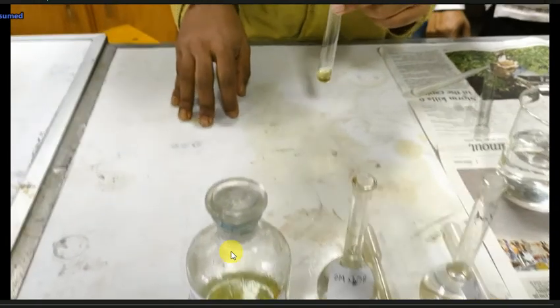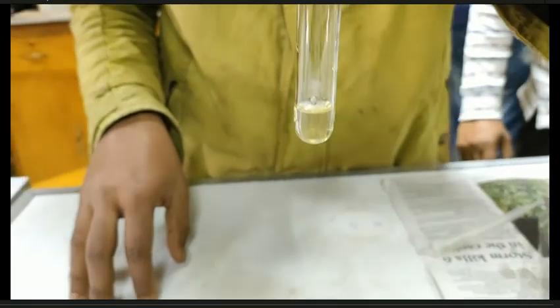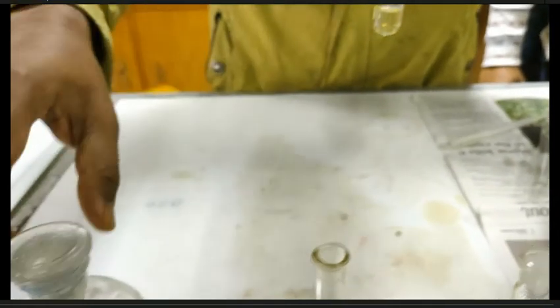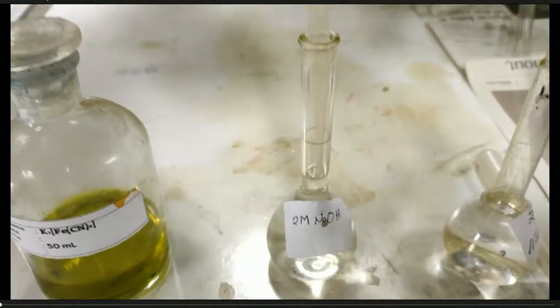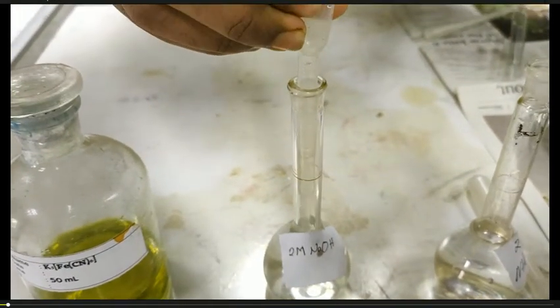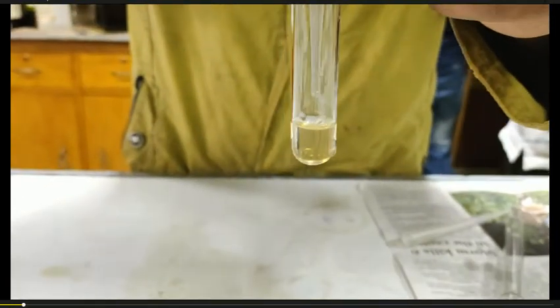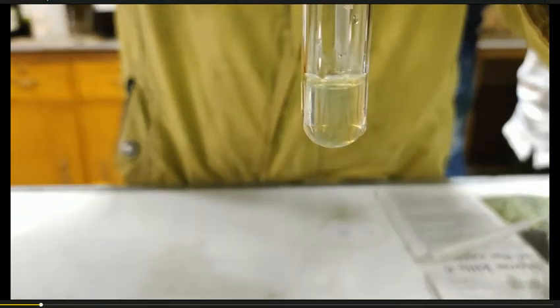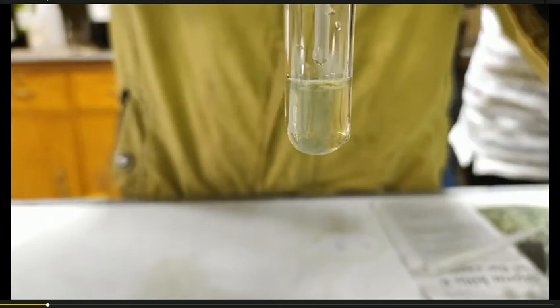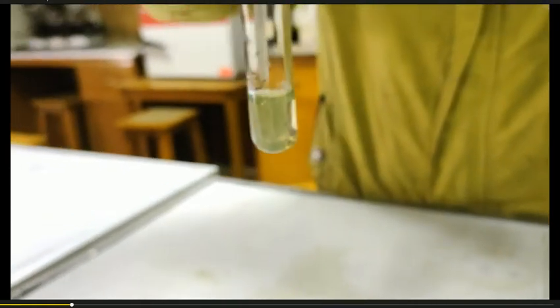We are going to test for the ferrous ion. We have taken 2 ml sample solution in this test tube. Now we are going to add 2 M dilute sodium hydroxide into this test tube. This will produce a light green gelatinous precipitate. We can see that this is a light green gelatinous precipitate.